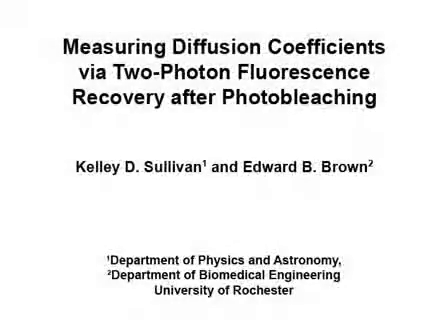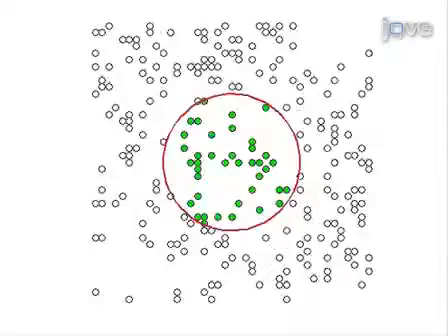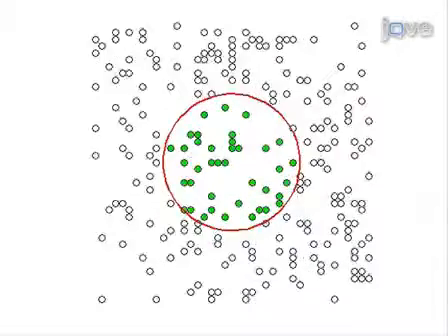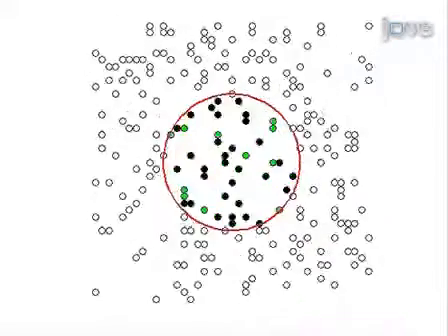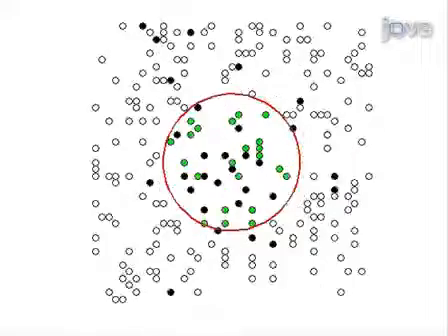The multi-photon fluorescence recovery after photobleaching procedure is easily demonstrated with a freely diffusing sample of fluorescent dye molecules. First, a low-intensity laser beam is sent into the sample to generate a reference level of fluorescence from the dye molecules within the focal volume of the laser.